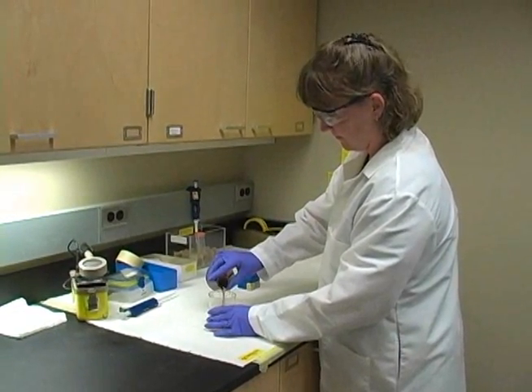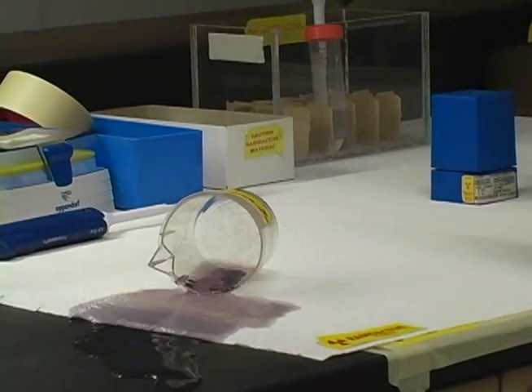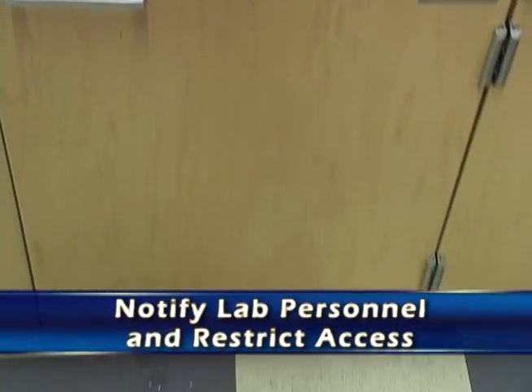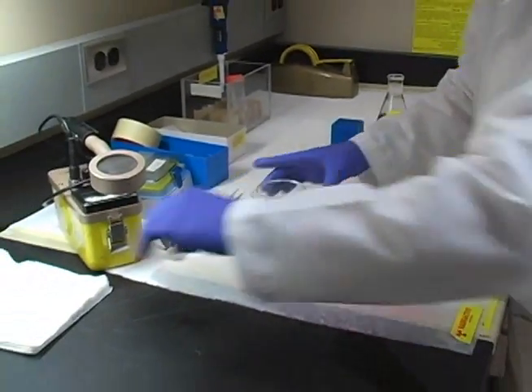Spills can easily happen. When a spill does happen, there are certain things you need to do. First, you need to make sure you notify everybody in the lab and restrict access. Anybody that doesn't need to be there should stay away.